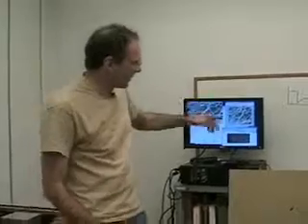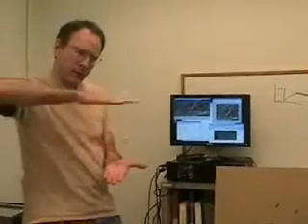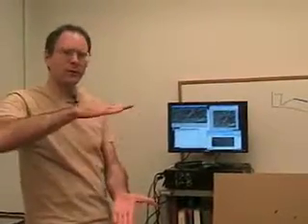The reason you want to be close to saturation, the reason you want to have some red in an image, and here I'm going to turn down my gain a little bit until I have relatively little red in the image, just a little. I want enough red in the image to tell me that my brightest things are just barely saturating. That means I know I'm filling all of the gray levels of the camera. This camera happens to have 256 gray levels, and I want to know that I'm making full use of them.